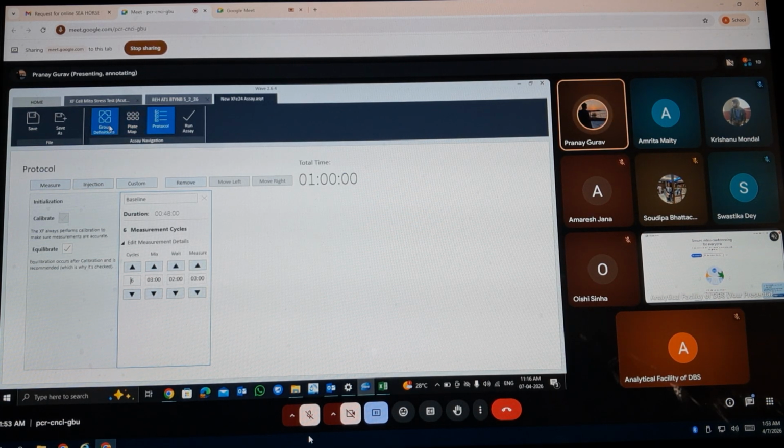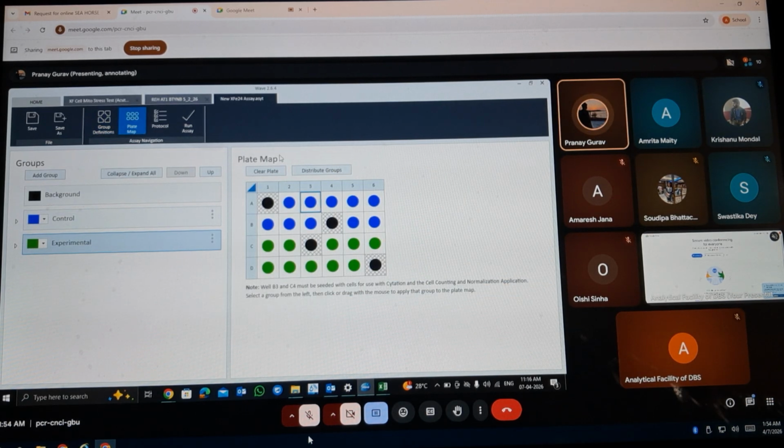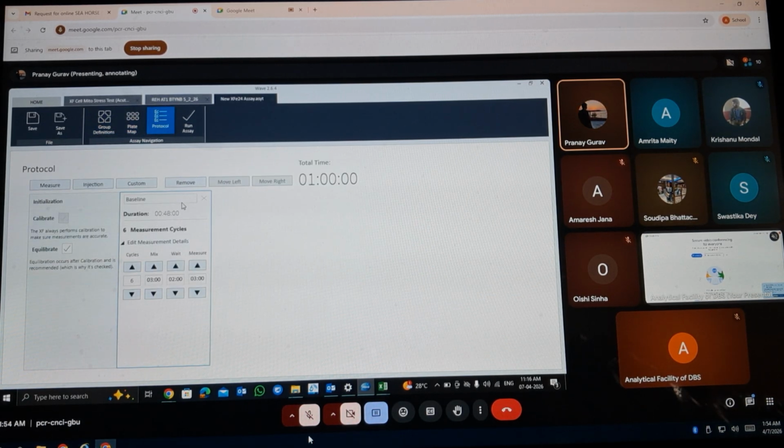We can also include untreated cells, the vehicle control, and your experimental condition like a drug. If you are including 2 different drugs, you can keep adding, so that 4 or 5 groups will be created. Just add them on the plate map and directly go for an experiment. So that's not a problem.